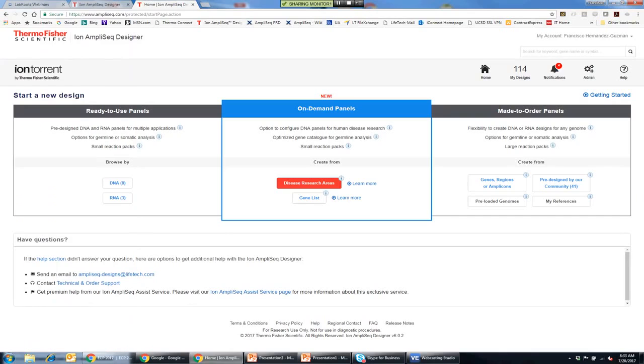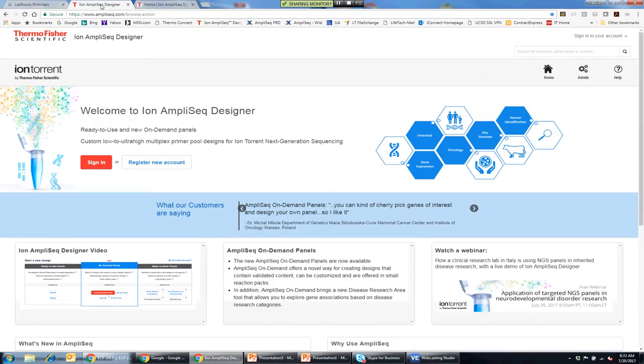Great, thank you. Can you please just kindly confirm that you can see my screen? Okay, I think hopefully you can see my screen okay. So what I'm going to focus on today is really getting a little bit more hands-on with the whole process of creating a panel. And as Dr. Murgia mentioned, we are using a website called ampliseq.com. And when you first visit the site, this is what you'll see.